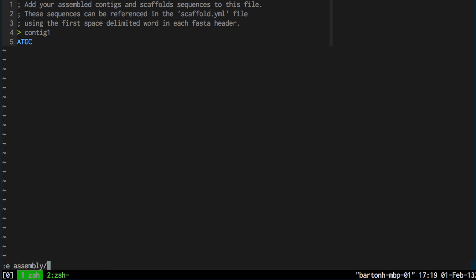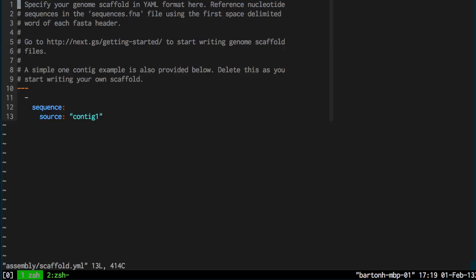The next file is the scaffold file which specifies how the contigs are organized in the genome assembly. So here it's just a single contig and I've specified it here. And this file is written in YAML, yet another markup language. It's a standard file format and if you go to this website here you can find information about writing these files.